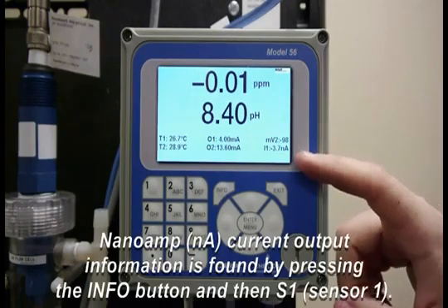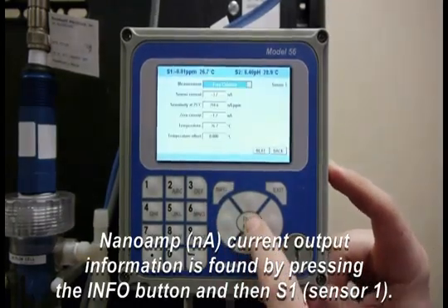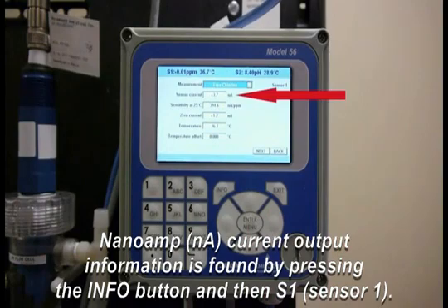If you have a different model, I'll show you how to get to it. You're going to go to Info, then go to Sensor One, then you're going to need to find the sensor current.